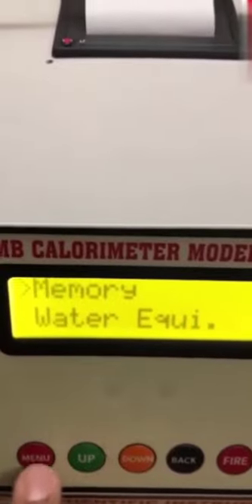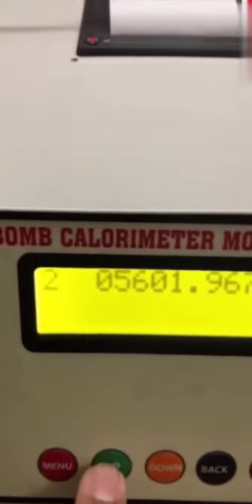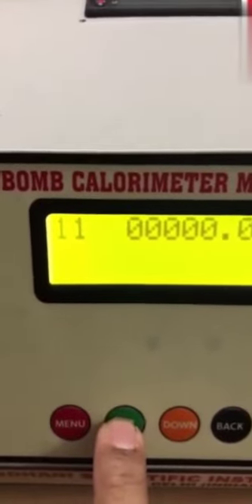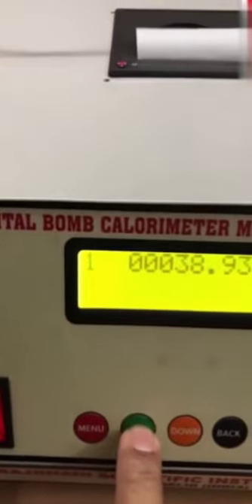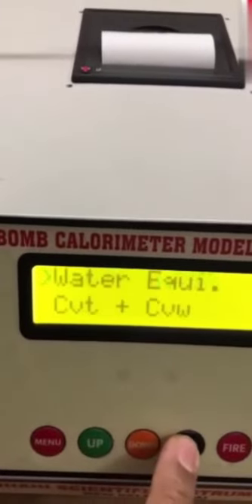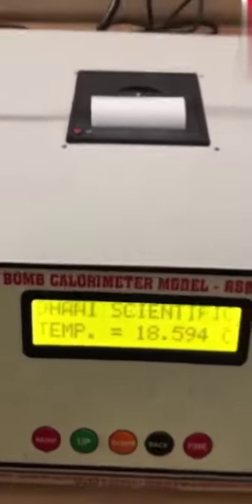The fourth option is memory — in memory we cannot edit anything. There are 11 memory locations. Press up button: 3, 4, 5, 6, 7, 8, 9, 10, 11 — and after 11, it will come back to 1. So it rotates in cyclic form. The last result is stored in the last memory location. To go back, press the back button, and to come out of the menu option, again press back button. This is the home page.